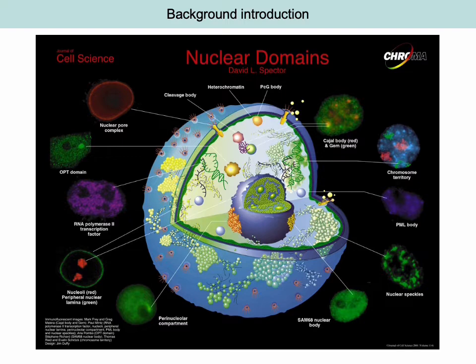It is important to look at both the proteins as well as the nucleic acid. I'm going to show you that just looking at each component separately could lead to a very misleading picture of the nucleus. When you have all these measurements in the same cell, you can arrive at a relatively more precise interaction between the protein part and the DNA part, and the overall structure makes a lot more sense at the single-cell level.